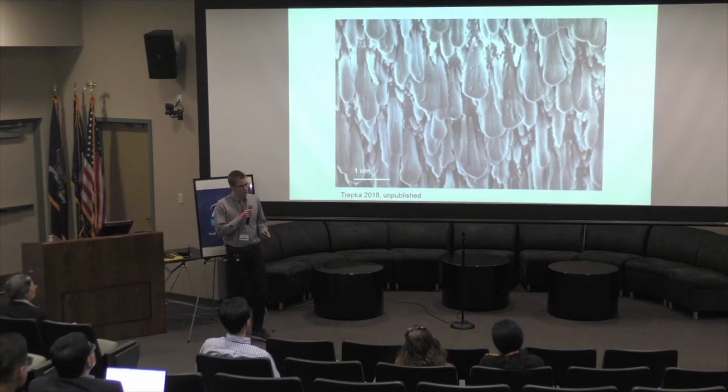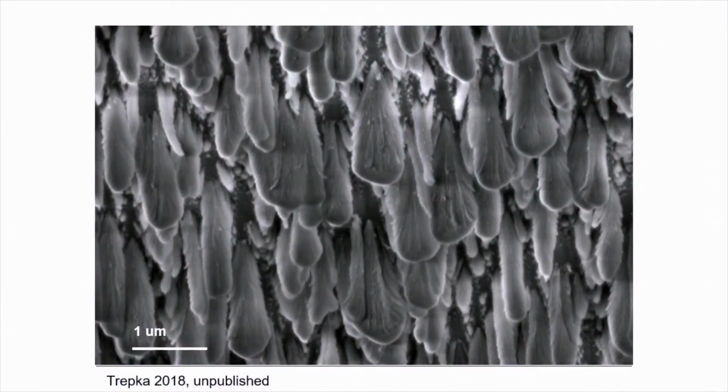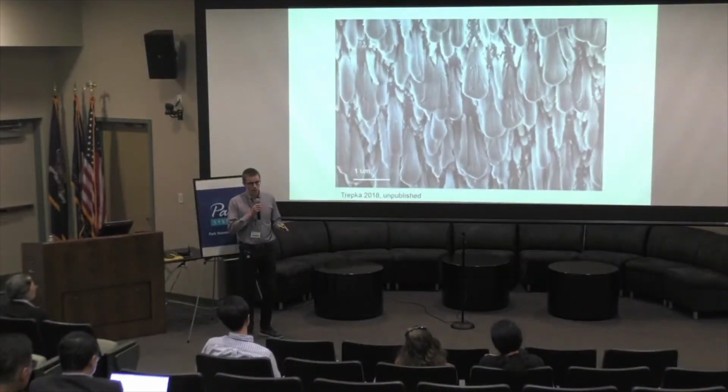The important question is, are there actually nanoparticles on the tips? Our preliminary answer is, it seems so. There are clusters of bright, distinct spots in the SEM, which often will indicate elemental contrast. The better answer is we can't be absolutely sure without TEM characterization of these products. But the preliminary information indicates that, yes, you can use nanoparticles in a similar way that Professor Zhao uses his colloidal nanospheres to grow things off of them and develop heterostructures that are nanostructured for the purpose that you want.